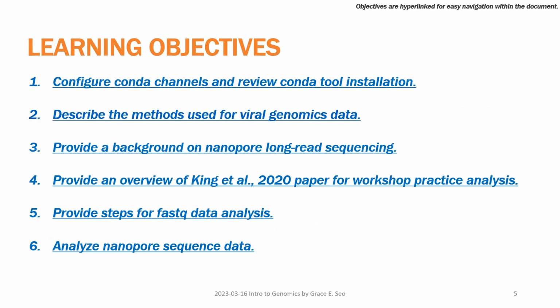Today's learning objective is as follows. Last week we did conda installation and tool package installation, but we had a problem where Jill found out that SAMTools was not properly installing, and she figured out a whole method to get it working properly. So I will go over this today briefly, and then we will update our package so it works when we need to use it.